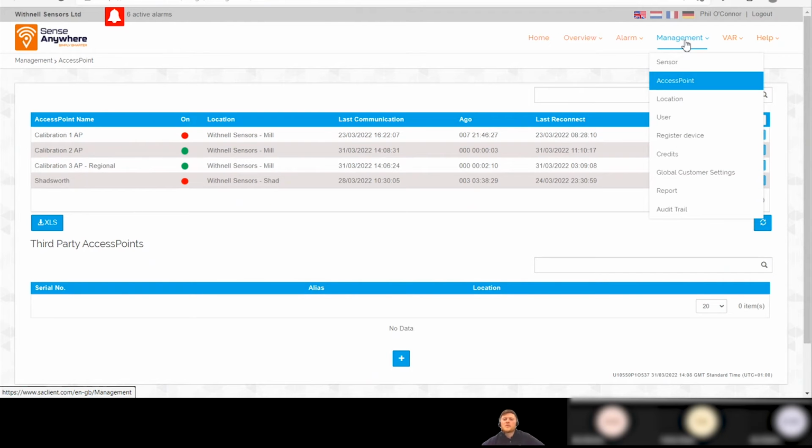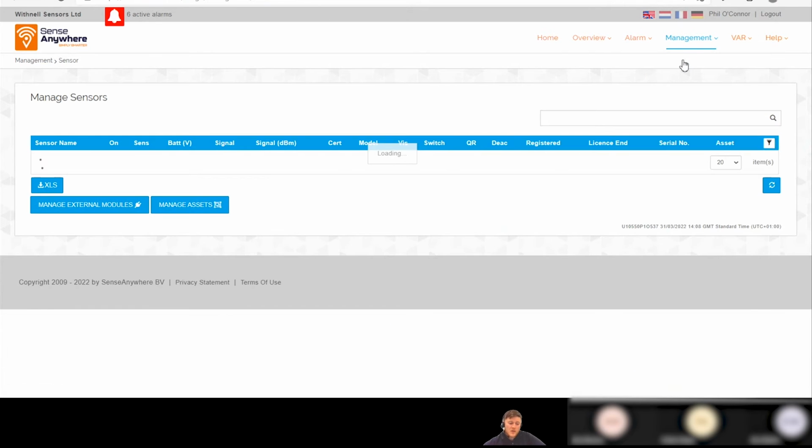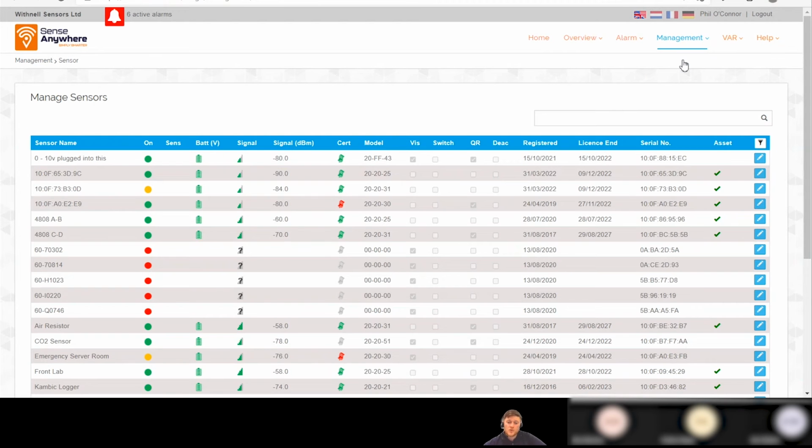There are various other things that people might have. I know a lot of you on the call don't have them right now, but a few of you will have the PT100 probes. Now, these are to measure the temperatures between -200 and +200 degrees C, whereas the sensors themselves only have an operating range of -40 to +70.